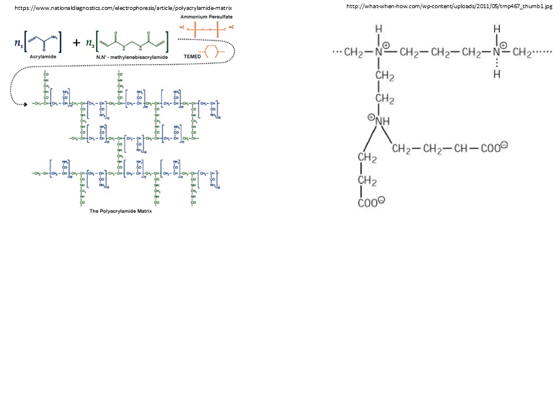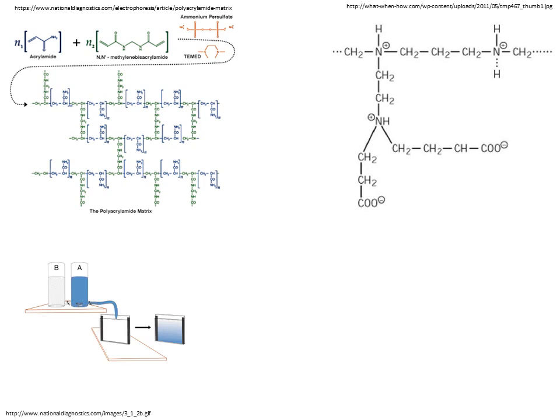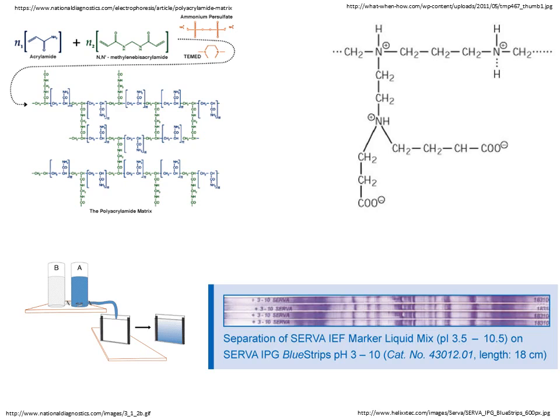By mixing different pH acrylamide derivatives and using a gradient maker, the resulting gel strip increases in pH across the strip length. Fractionation of the protein by charge works in exactly the same way as described a few slides ago for carrier ampholytes. The result, as shown in these strips, is the fractionation of protein by charge into discrete bands of protein molecules.